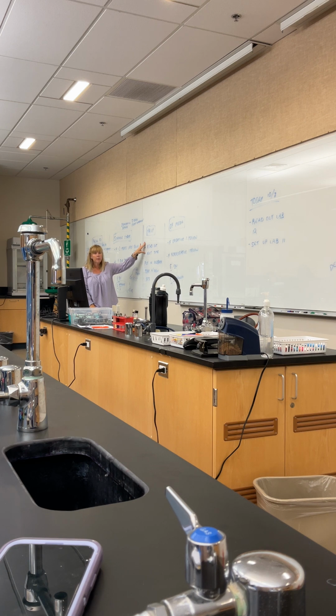But he's going to go back in the incubator with all of your new tubes today. The reason for that, the MR test is usually very quick and easy, and we get a really quick response. The Voges-Proskauer, the VP, sometimes it needs an extra few days, so I'm just going to wait and let it cook a little longer. I need the bacteria to get up a little higher, all right? And I just want to make sure, so we're going to cook them, and then we'll look at them next time. So this one you can skip for today. We'll be reading them out next time.